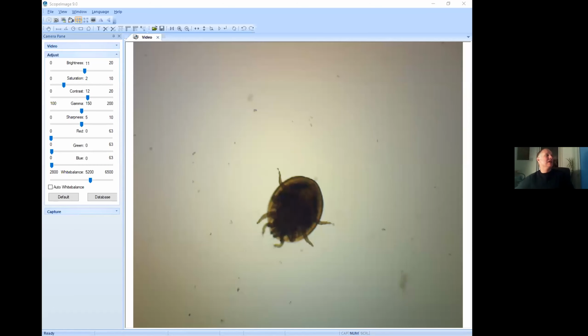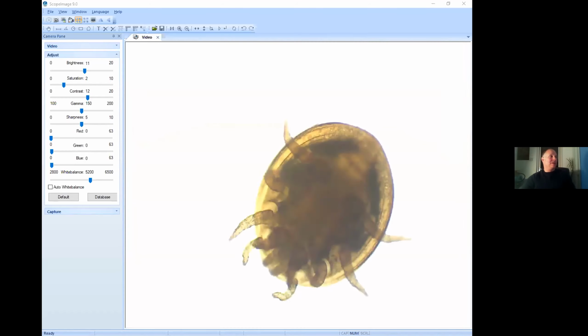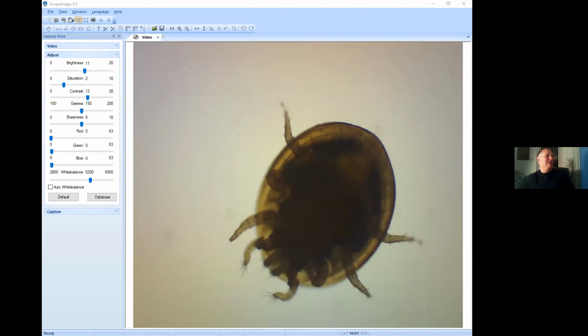Right, so what we have here, let's see. I'm going to share my screen again. So this is a turtle mite, as you can probably tell, but this is just with the lighting from underneath. As you can see certain features fairly well, but where you get to the middle dense part, it becomes very dark and quite hard to see what's going on.